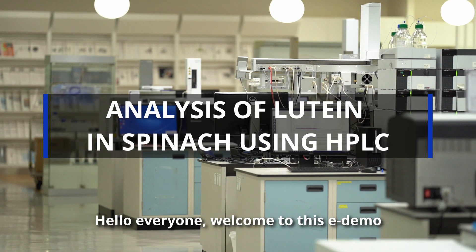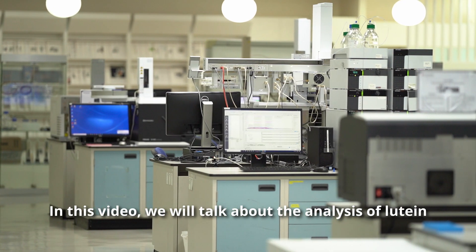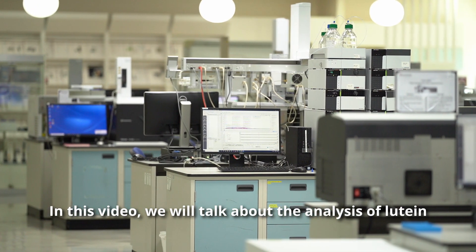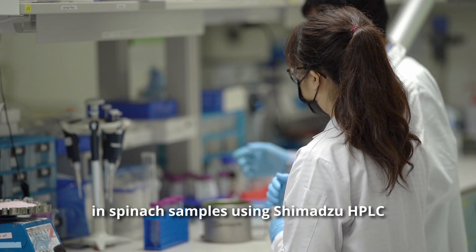Hello everyone, welcome to this e-demo. In this video, we will talk about the analysis of lutein in spinach samples using Shimadzu HPLC.